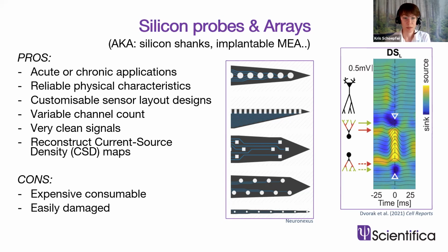All of this is great, but the downside to these, they are rather expensive consumables, typically costing several hundred to a couple thousand dollars a piece, and they are easily damaged. For this reason, a lot of companies may sell kind of dummy probes for training.